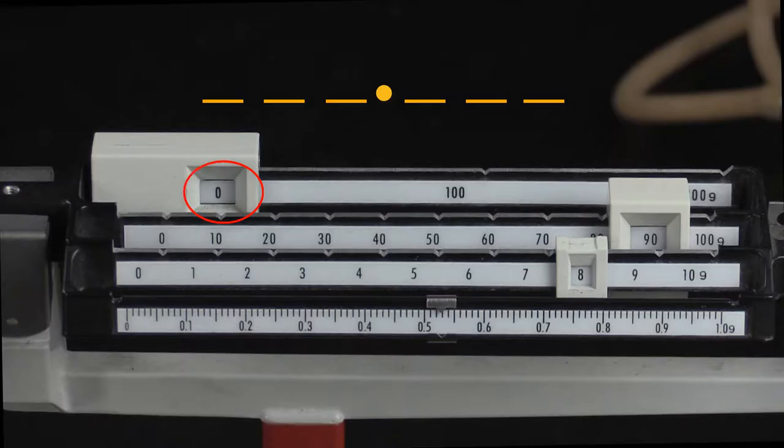Read from the largest place value to the smallest. In this case, notice that the slider indicating the hundreds place is in the zero slot. So there is a zero in the hundreds place. Next we move to the tens place. The slider is in the 90 slot, so there is a nine in the tens place.